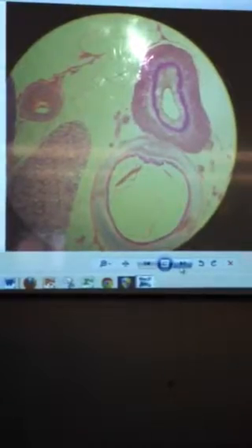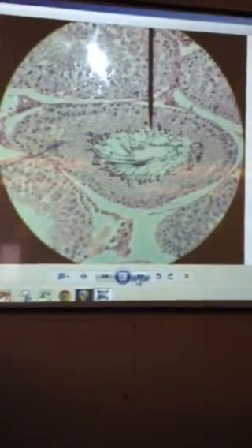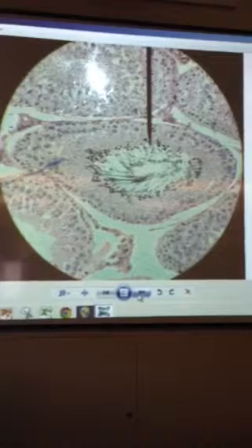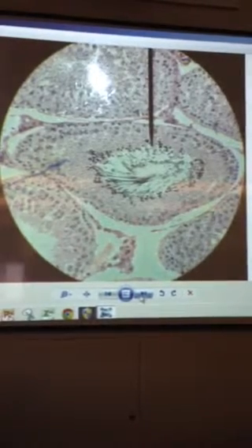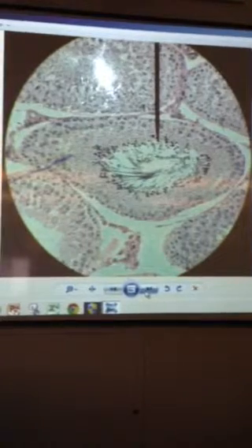And then esophagus and trachea. So I think that's all. We're back to the testes. So I'm going to put these together. And if you get any good pictures today, send them to me, and I'll get them into a PowerPoint. I plan to do that this afternoon.